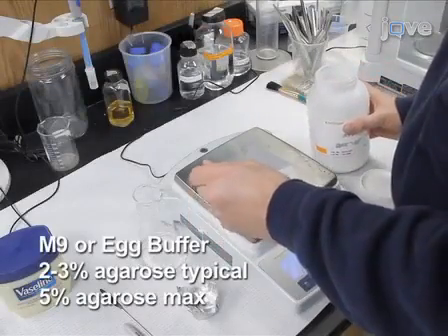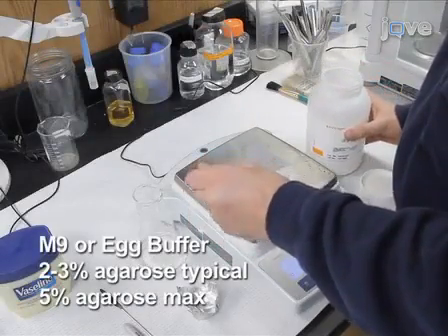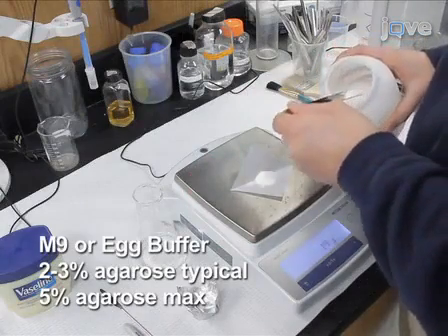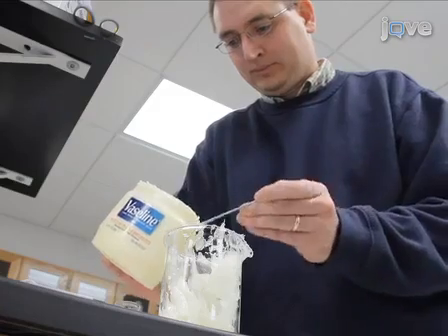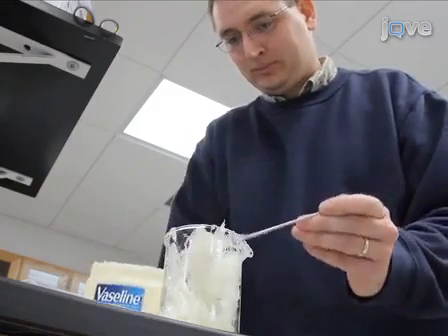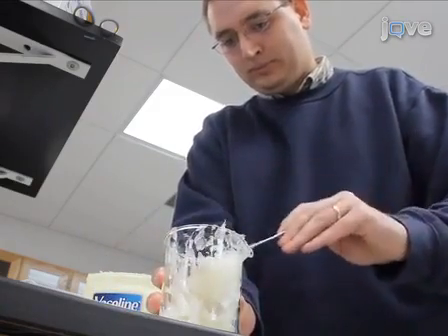To prepare embryos for imaging, first make two mounting solutions. One is melted Vaseline and the other is 2 to 3% agarose in buffer. Denser agarose can be made if the structures to be imaged are very fragile.